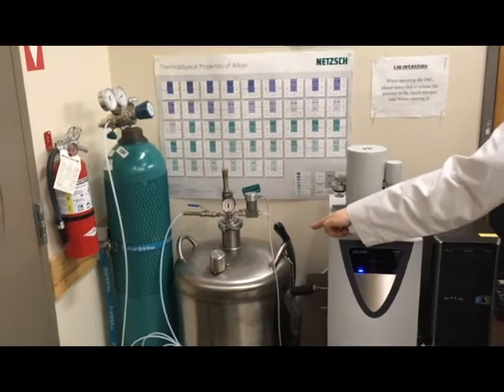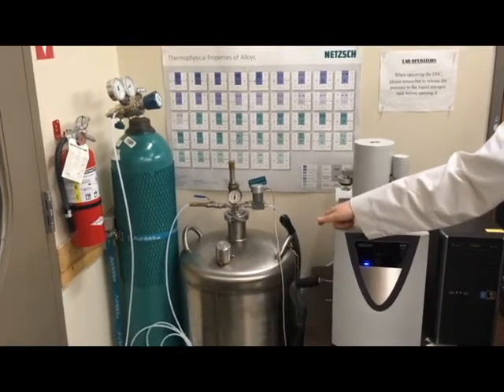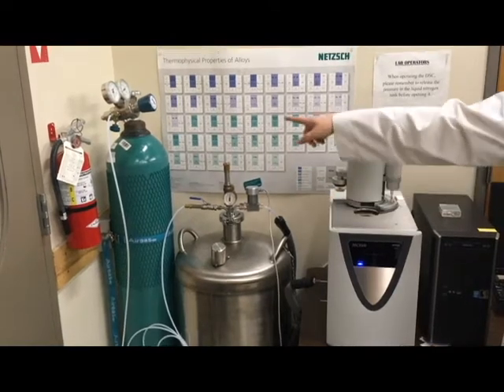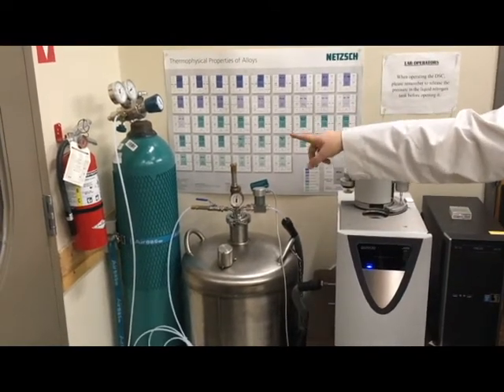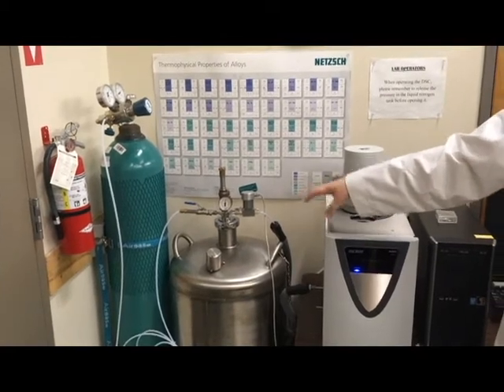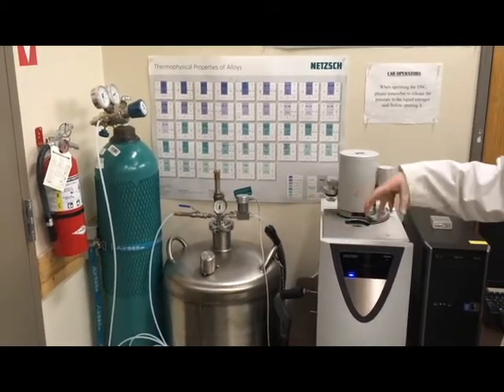Next to it is a dewar of liquid nitrogen. The liquid nitrogen serves to cool down the DFC. It is pressurized using the compressed gaseous nitrogen next to it, and then the liquid nitrogen flows through the DFC.